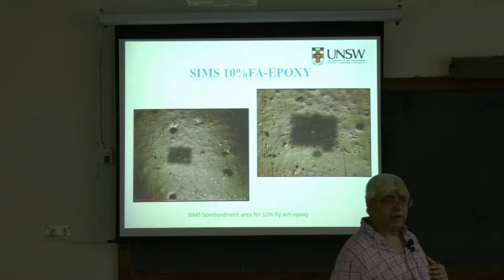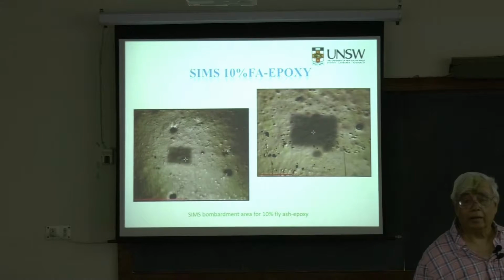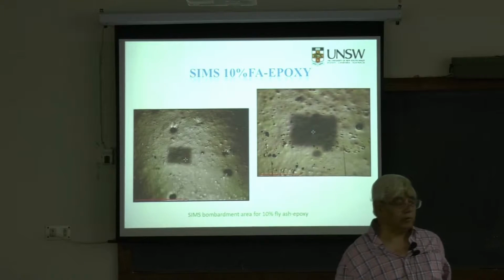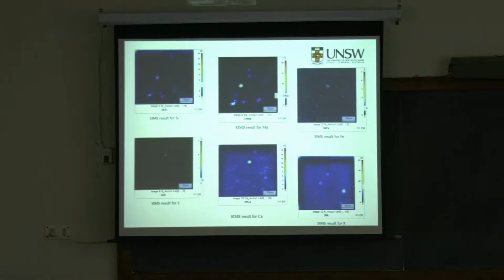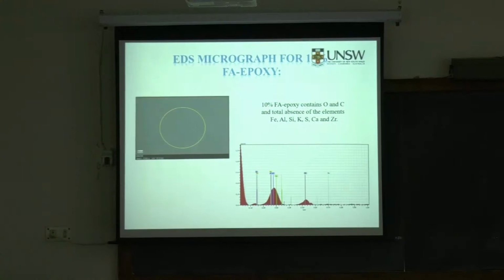What does SIMS stand for? Secondary ion mass spectroscopy. Yes, thank you. So this is how you can identify these particles in presence of all these things by using SIMS.